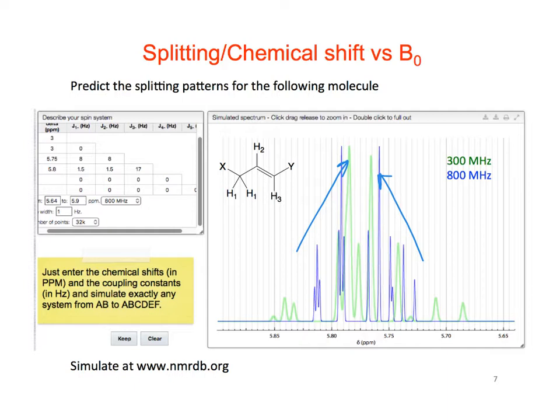No, it's a triplet, right? Because both of them, both H2 and H3 up there, should be doublets of triplets, like we drew before. They both have the same doublet component. Where's the doublet? This is the doublet, the one on the left and the one on the right, and here, 17 hertz. Only that explicit peak of that triplet peak. There are 2 triplets on the right, they're just spread out.